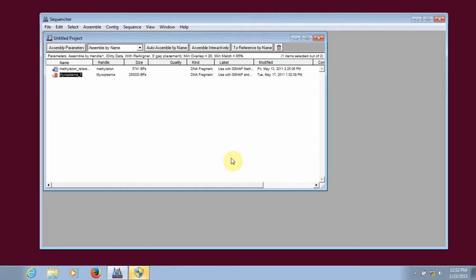Hi, this is Jason from GeneCodes Corporation. Today, we're going to look at how to align to a reference sequence with NGS data in Sequencher. This is the fourth video in the tour guide of Sequencher series.